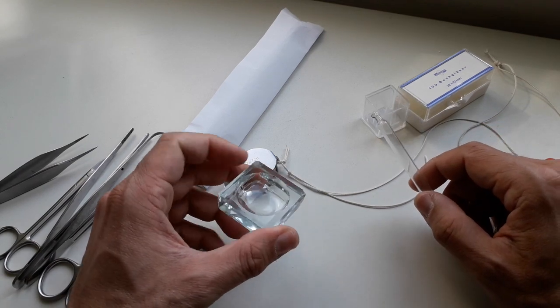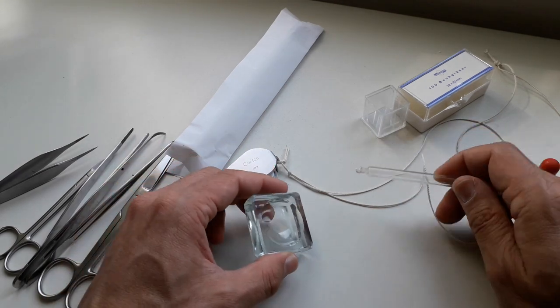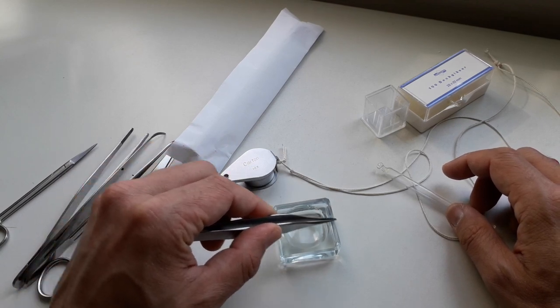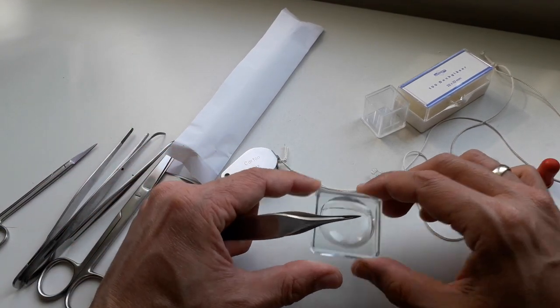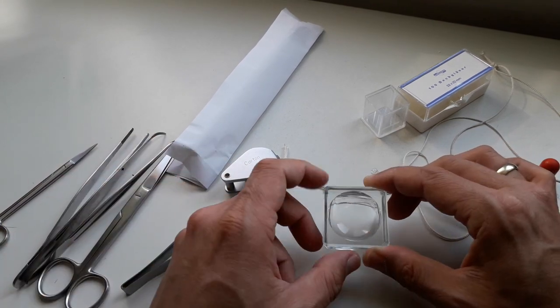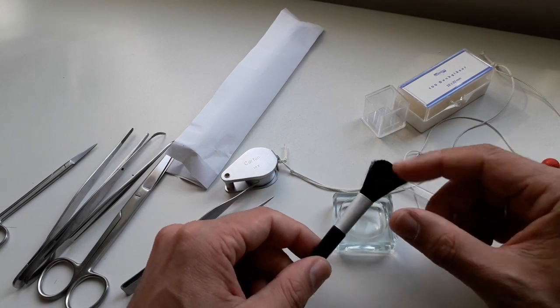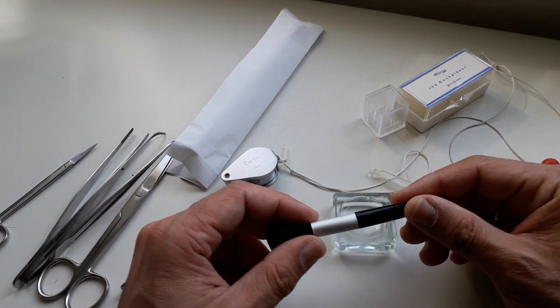I also use them for staining. So I put some stains in here, and then I transfer the plant material, usually using the tweezers, into the stain and then out again, and so on. Quite useful, not absolutely necessary. You can also use some other kitchen utensils here, but it works. A brush to clean some stuff off.